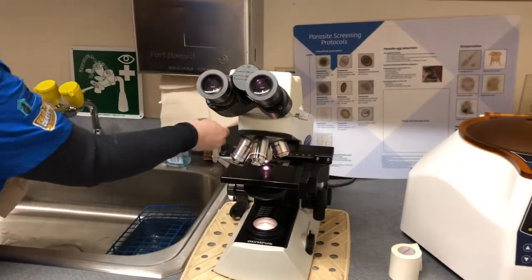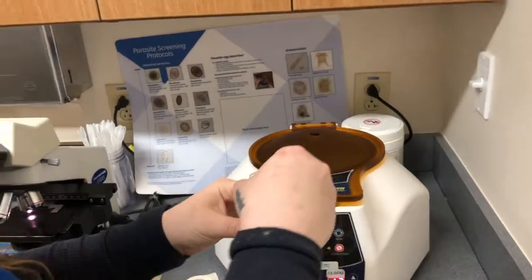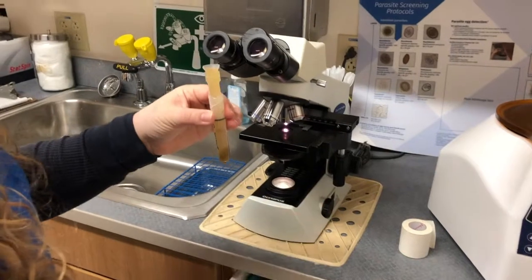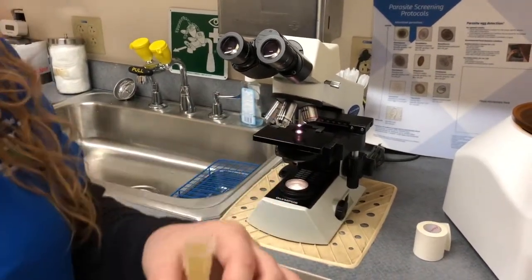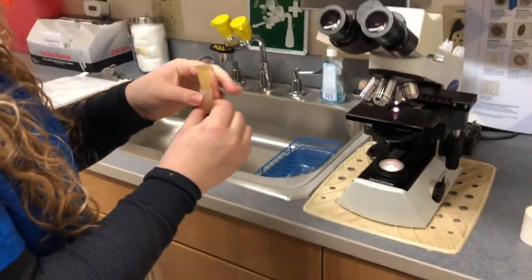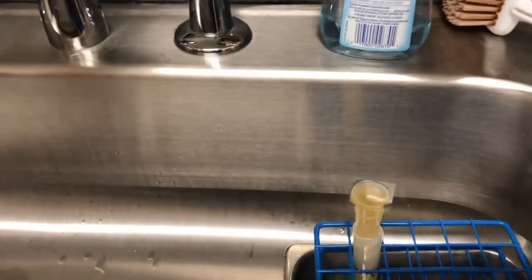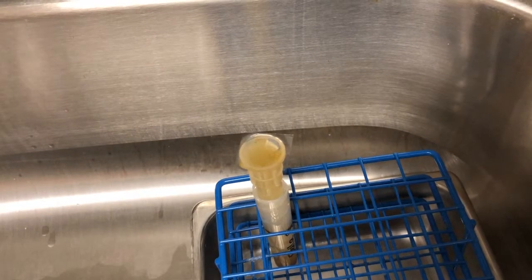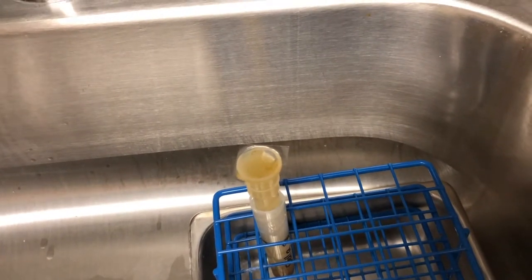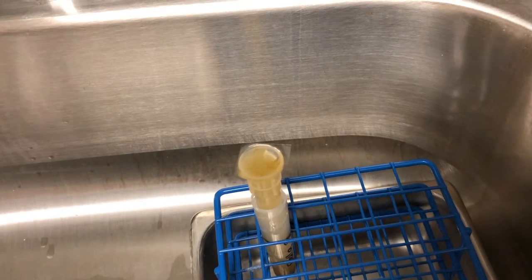She's got this microscope here where we can read the sample when we're finished spinning. It looks pretty much the same but you can see some of the solids have gone down to the bottom — centrifugal force has forced those things to the bottom and centripetal forces force the worm eggs to the top. She's twisting the tube, which causes fluid to come to the top with a little meniscus, and then she places a cover slip — a tiny thin glass slide — on top for three more minutes so the eggs stick to that glass.